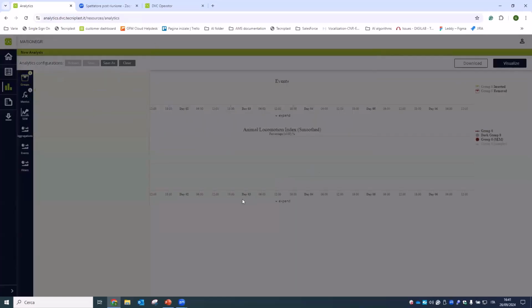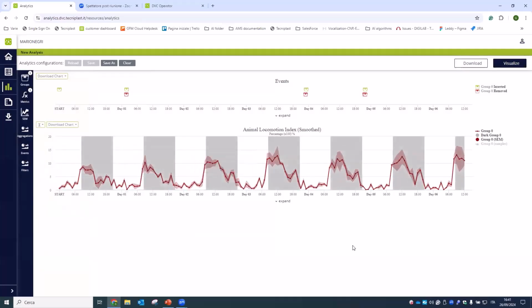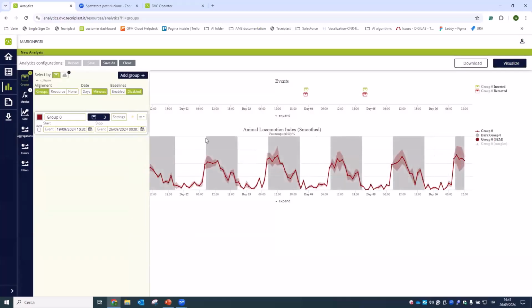Then we repeat also with the event. Here it comes. This is the absolute interval of time of the analysis. As said, you can easily adjust. By clicking minutes, you enable the minute. If you stay on the day, it will start at midnight. I made a mistake because I selected the event without selecting the minutes. My fault, sorry.